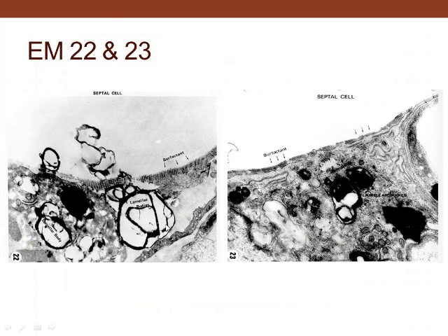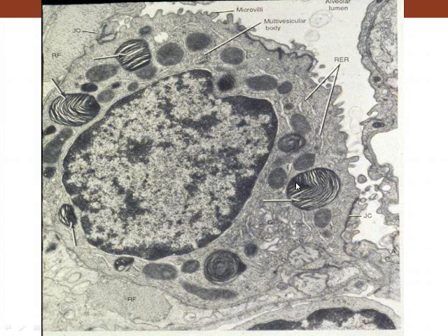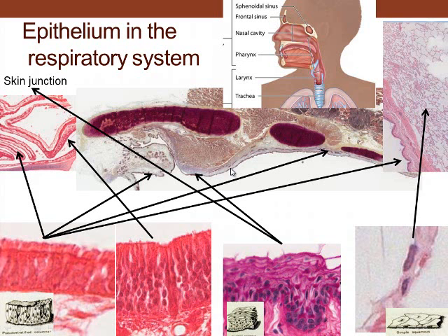Here we see the surfactant secreting cells. This is surfactant lamellar body structure that lays over there, reduces the surface tension. Here we see the surfactant globules here, which ultimately will line the cavity of the airspace with a waxy type substance that will reduce the surface tension.